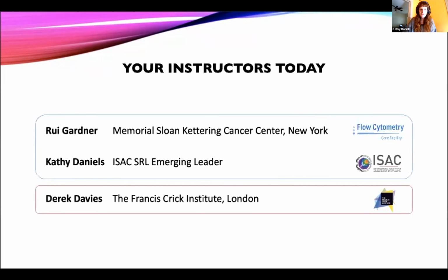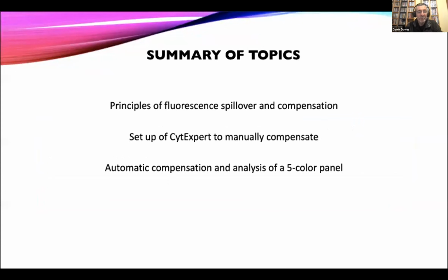Okay, so as usual with these classes, we'll start off with a little bit of the background, the theory, so that everybody's in the same sort of place. But we'll try to spend most of the time actually doing some practical work on the CytoFLEX. So I'm going to go over the principles of spillover and compensation, and then I'm going to hand over to Kathy, who's going to use the CytExpert software on the CytoFLEX to first of all manually compensate some samples, and then look at automatic compensation. And we have a 5-color panel, which we'll come to a little bit later on. We'll tell you what we're doing.